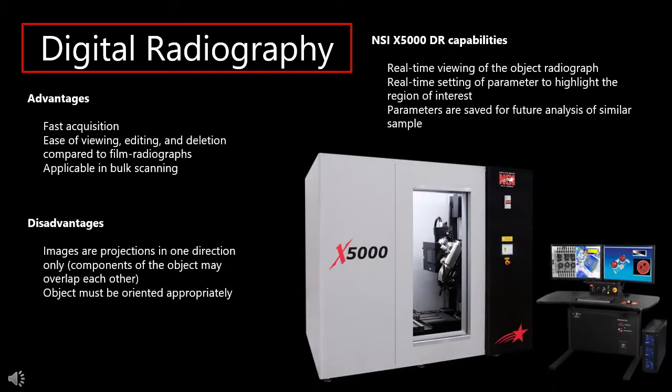So here are some advantages and disadvantages of digital radiography. The first advantage is that it can capture images relatively faster than the use of photosensitive films. There is also an ease of viewing, editing, and deletion compared to the use of film radiographs. Since everything is done digitally with the help of software and computers, it can be easily viewed, edited, or deleted. It is also applicable for bulk scanning. It depends on the setup of the samples in the X-ray machine.